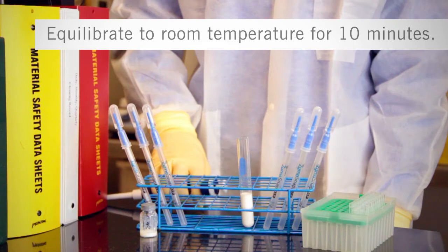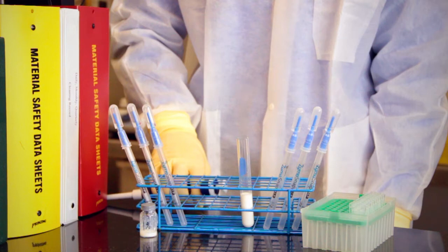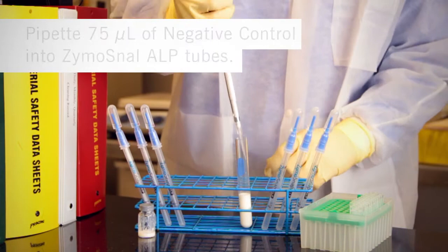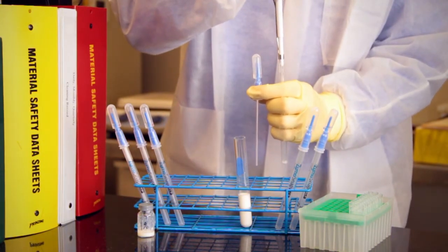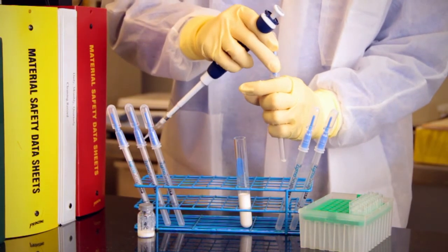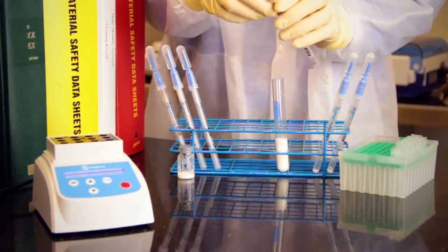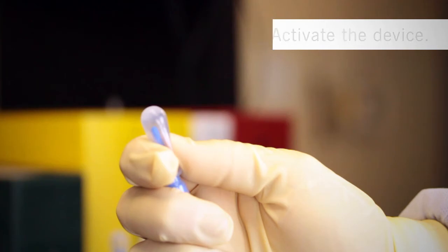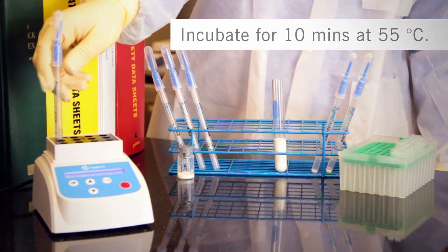Step 3: Perform the control testing. Allow 6 Zymosnap ALP test devices to acclimate to room temperature before testing. You will run 3 replicates from each positive control and negative control sample. For negative control testing, pipet 75 microliters of negative control into 3 Zymosnap ALP test devices. Replace the snap valve bulb into the tube. Activate the device by bending the bulb forward and backward to break the snap valve, then squeeze the bulb twice to release the reagent into the tube. Shake and flick the device in downward strokes to ensure all liquid reaches the bottom of the tube. Incubate for 10 minutes at 55 degrees Celsius.